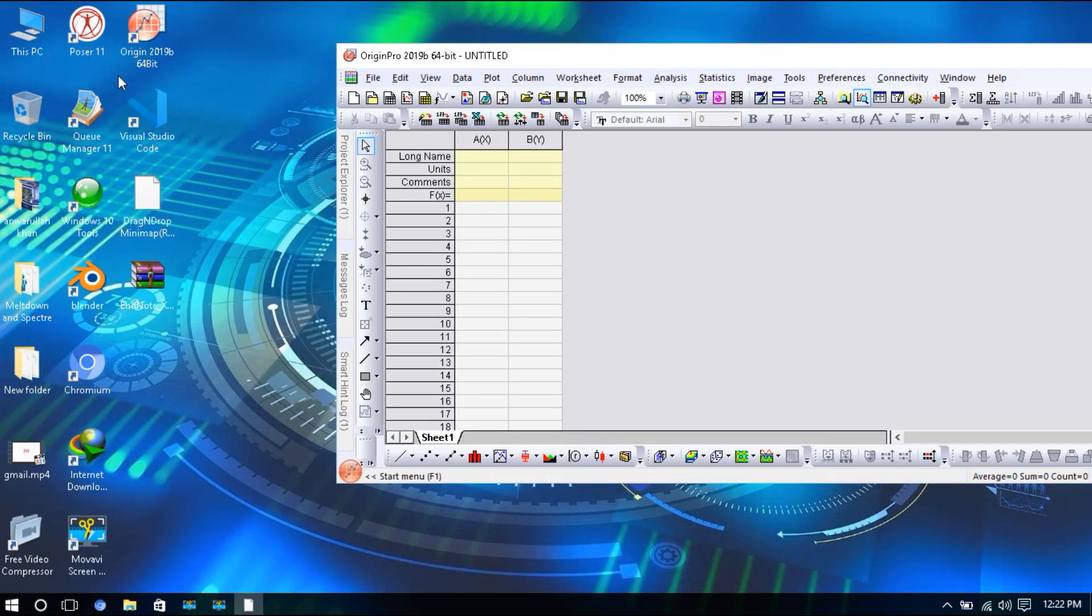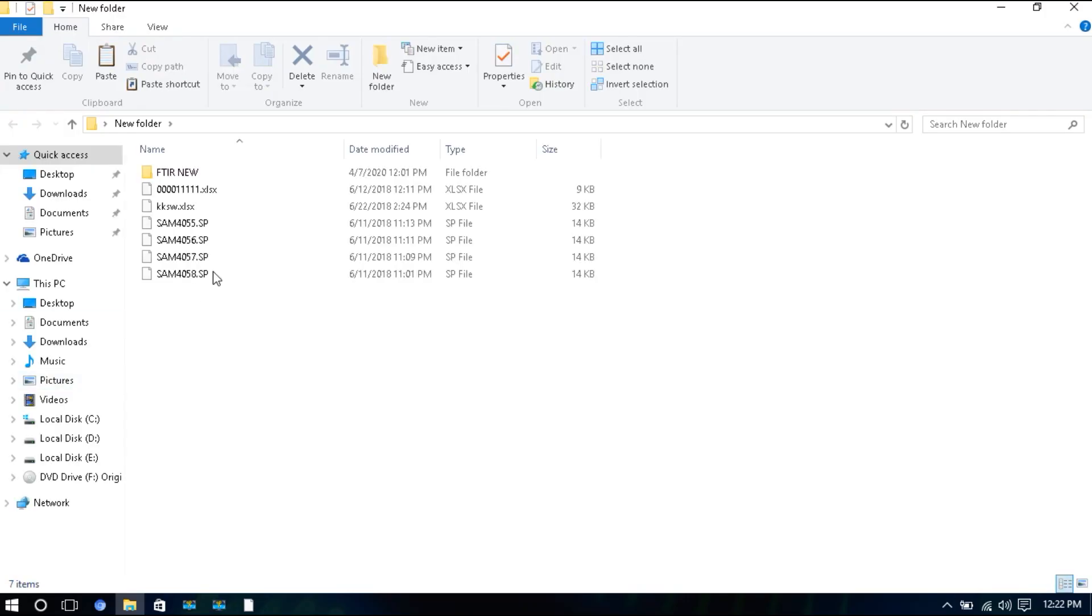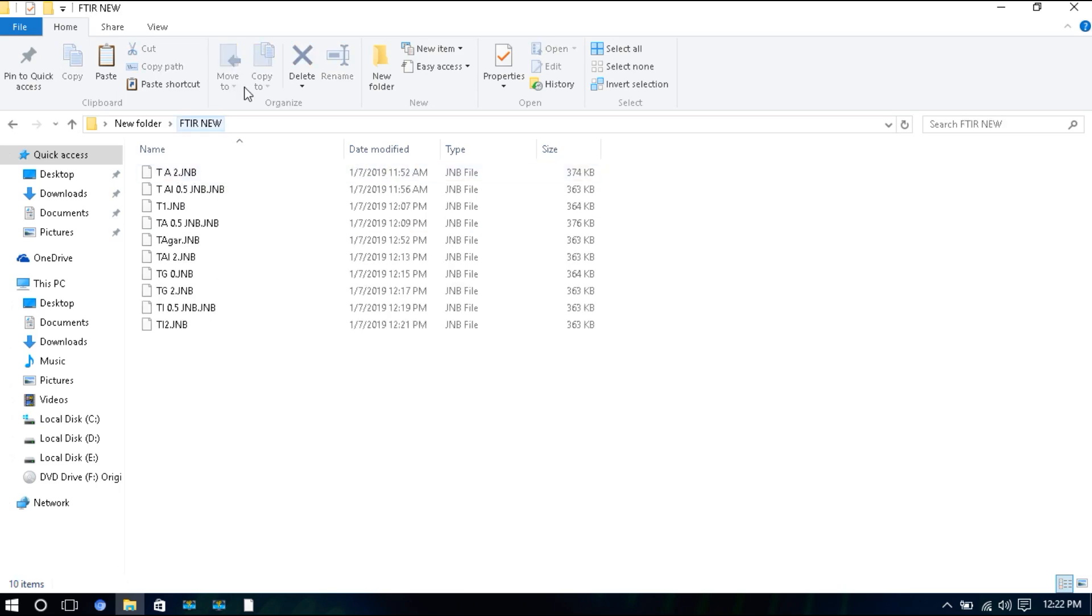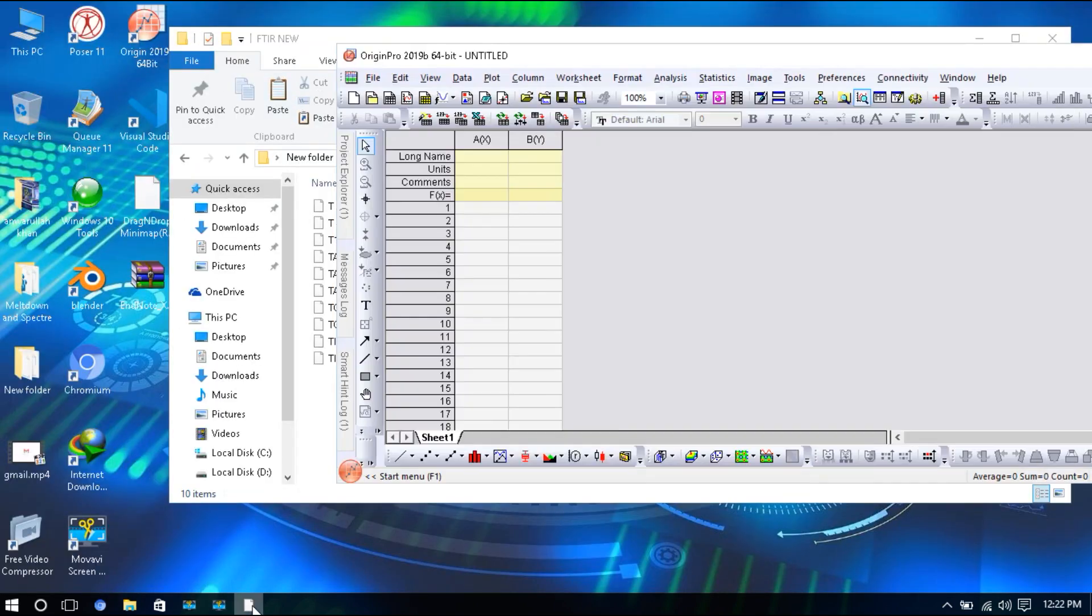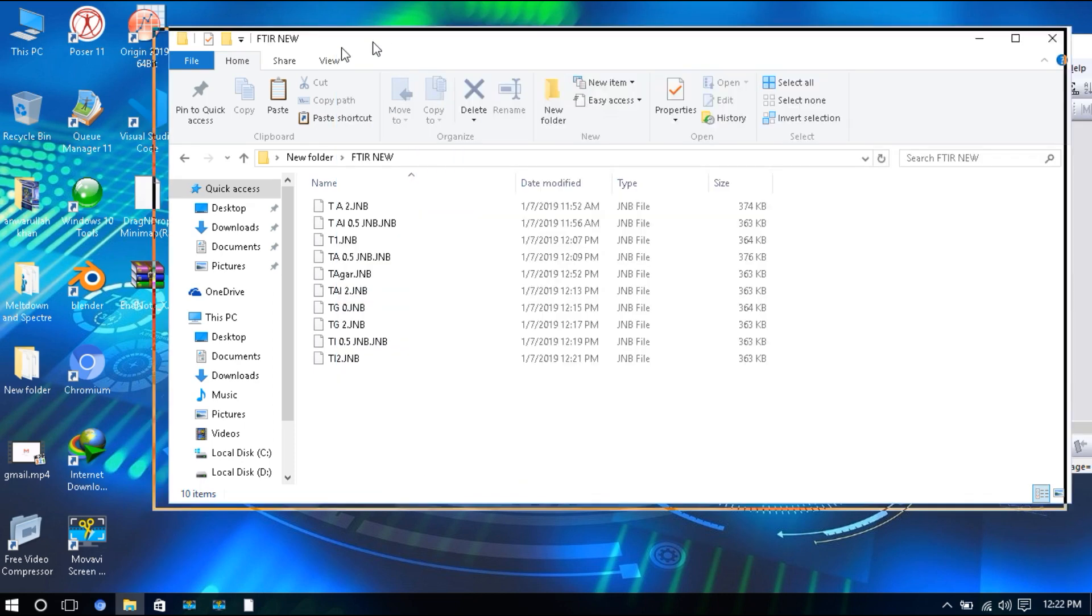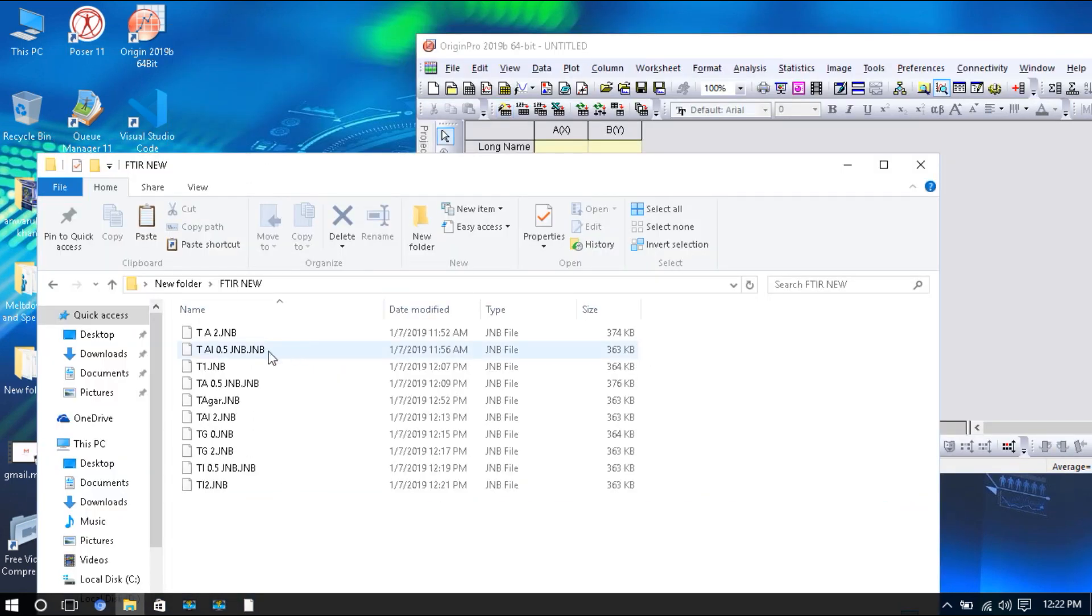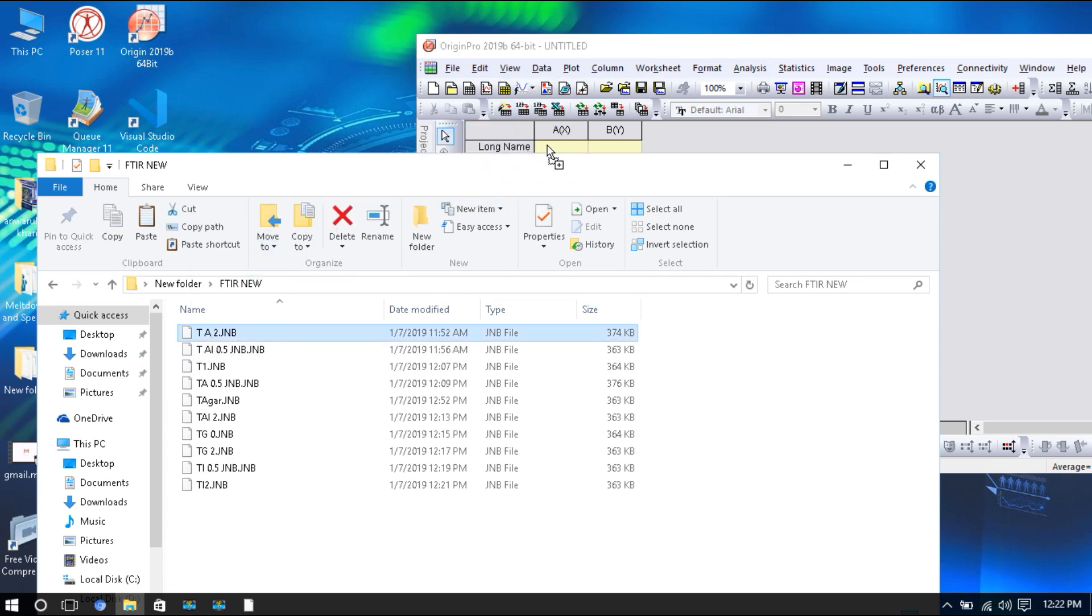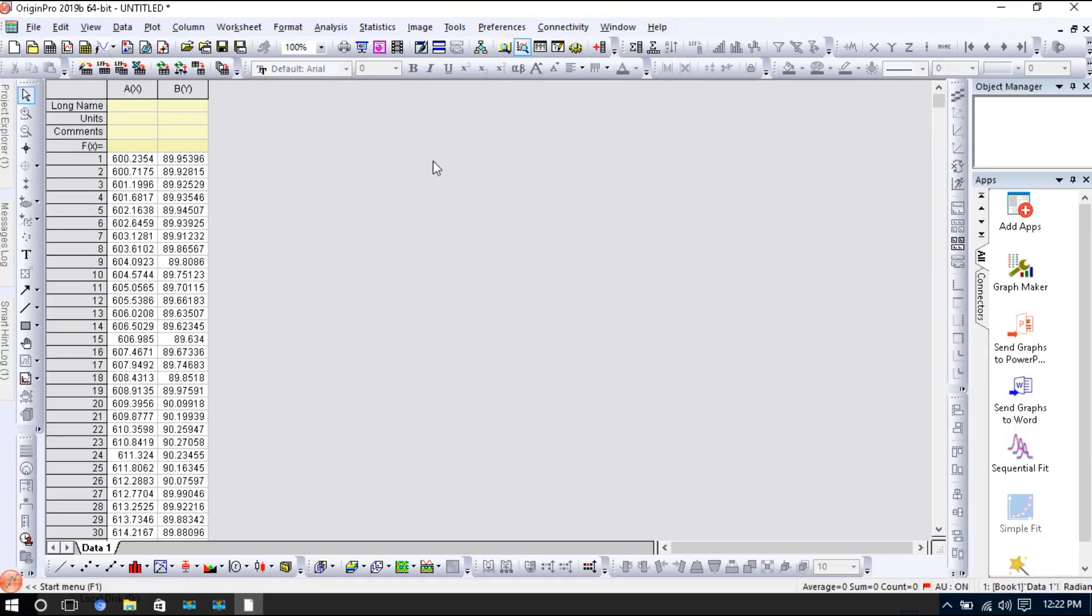Next, we will open our FTIR data file. My file is located here, FTIR new. It is very easy to open this. Just drag your file to your Origin Pro software. I have just dragged my FTIR file to my Origin Pro.